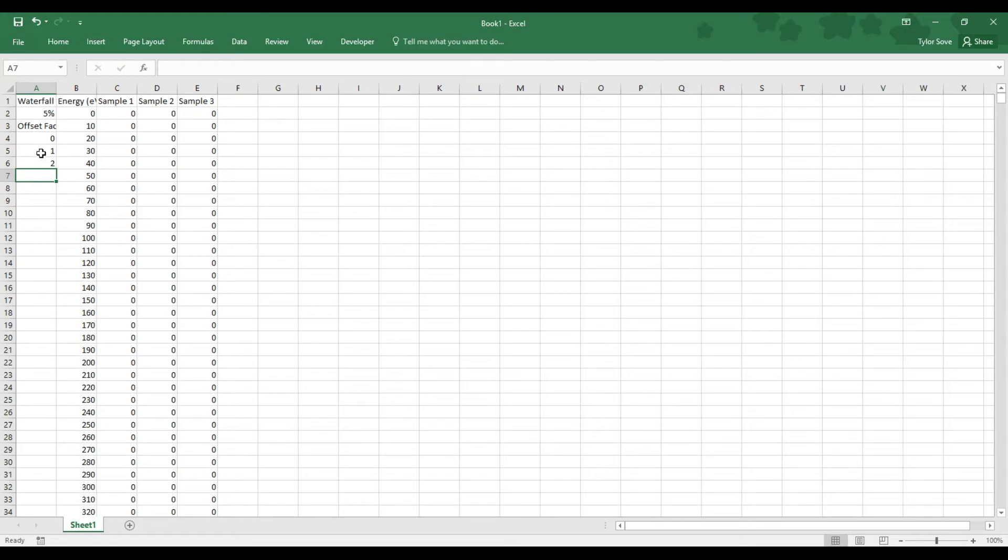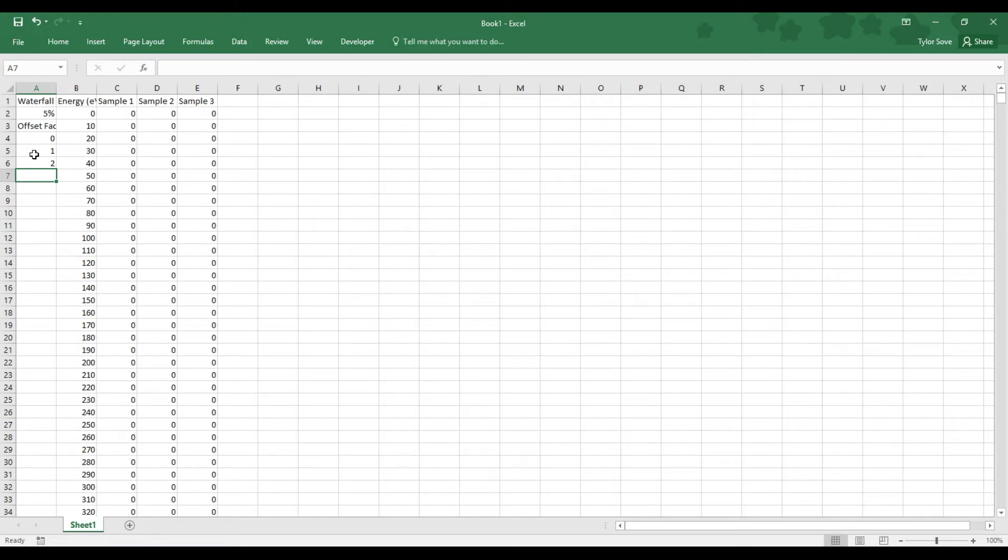This information along the left will allow us to offset our data from itself, or offset each sample's data from each other's sample on our graph, and that will give us the waterfall aspect of our waterfall graph.